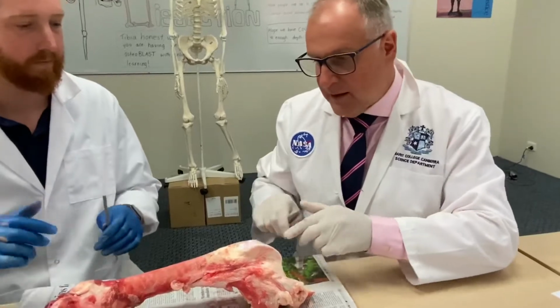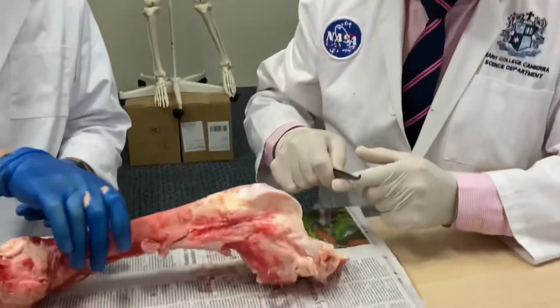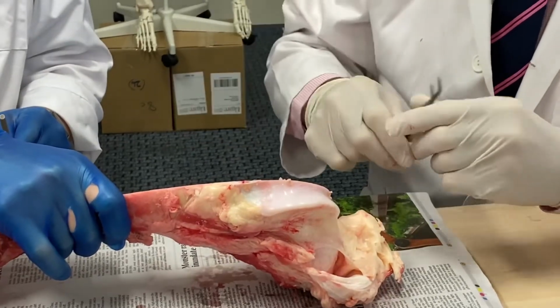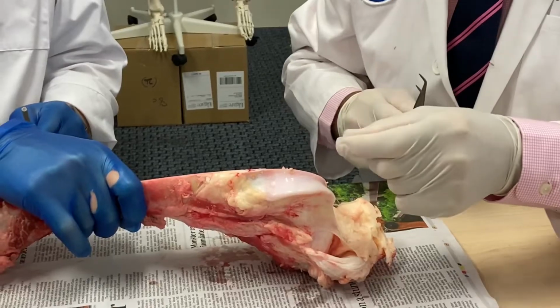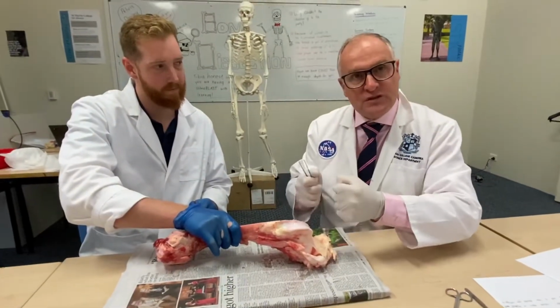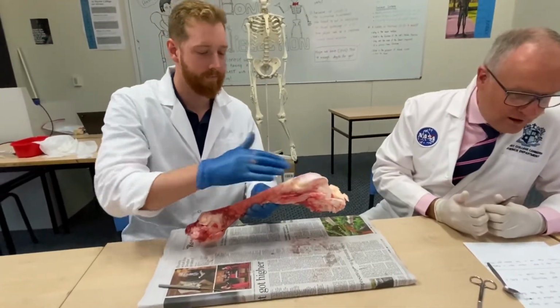Okay, so the next part is we've gone to the epiphysis, the epiphyseal plate, the diaphysis. It is key to highlight this section referred to as the articular cartilage. This marble-like, white, glossy, but if you were to run your finger over this, very slippery, fine, very viscous. You can nearly picture this as the oil in the engine of the car that reduces any friction or parts rubbing over each other. So cartilage, as we've just mentioned, is remarkable, it's extraordinary.